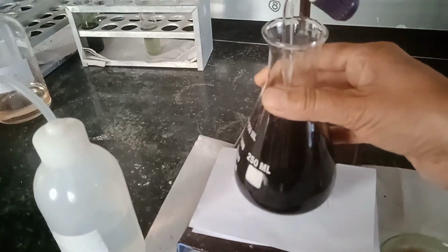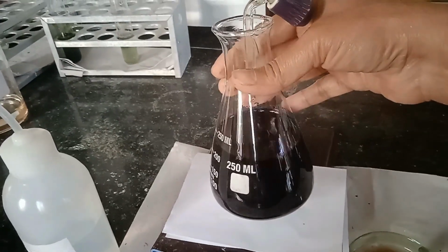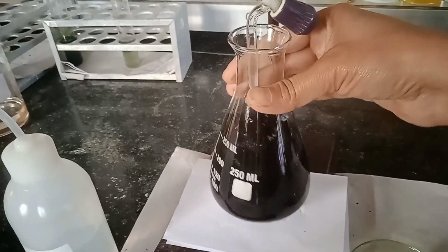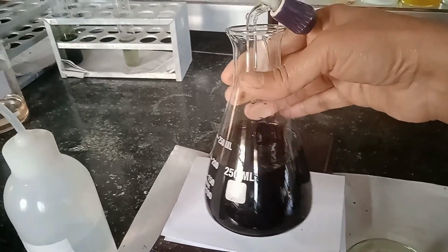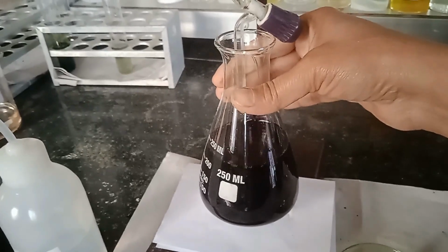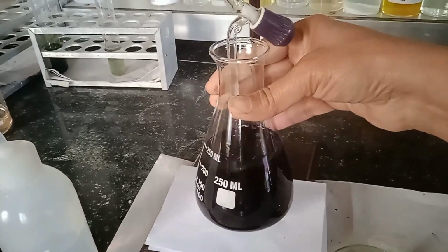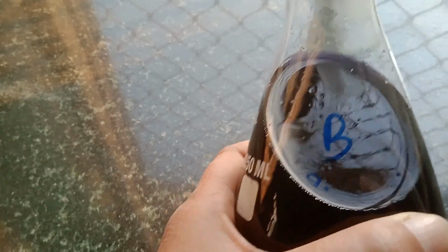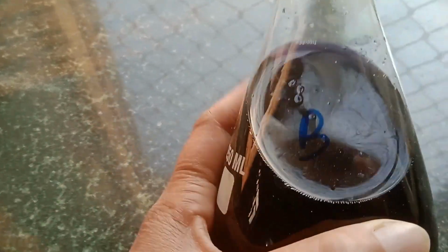It is a little difficult to observe the color change through this camera, so while you are doing this, you should be very careful at the moment when the color changes from Persian blue to green. Here you are able to see the color changes to a greenish type. On using phosphoric acid, H3PO4, in this reaction mixture, it is easy to detect the end point.